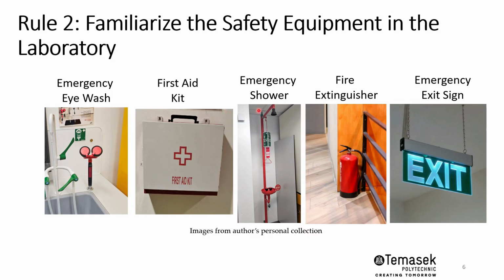Emergency shower is also important. Know the location of where they are while working in the laboratory. They are useful especially if you have large amounts or even small quantities of corrosive chemicals that got onto your body. It's important that you walk briskly to the shower, take off your lab coat, and then start to flush away any of the chemical or solution.